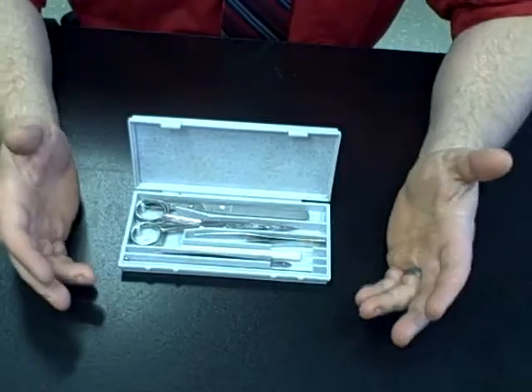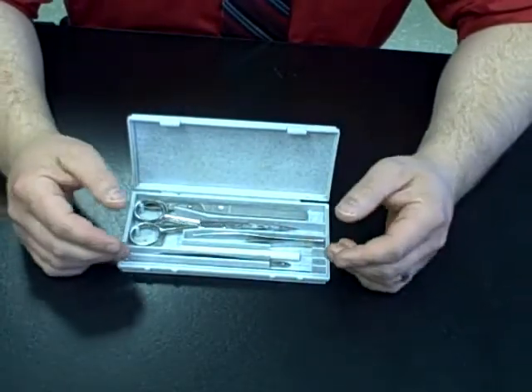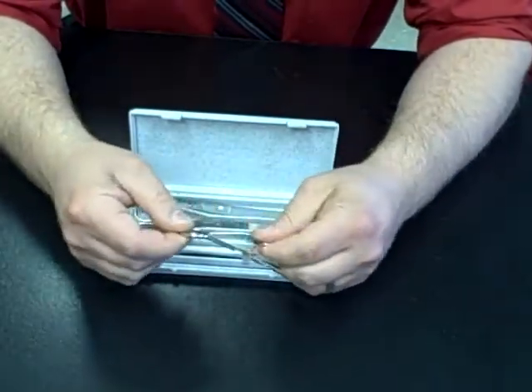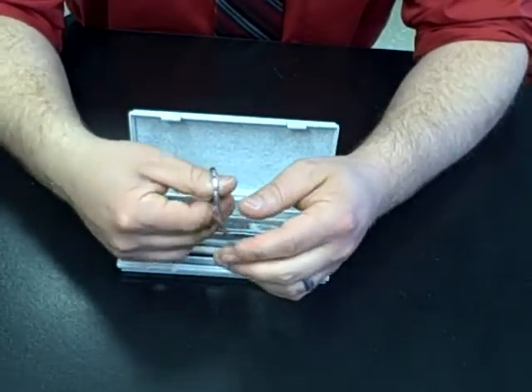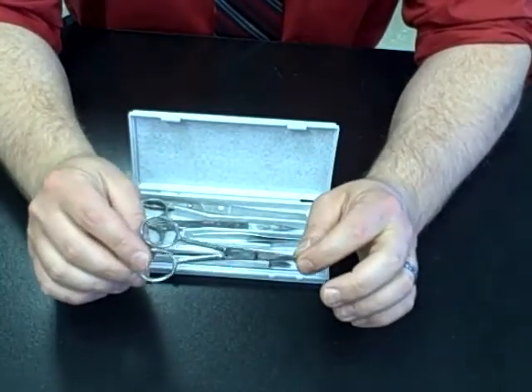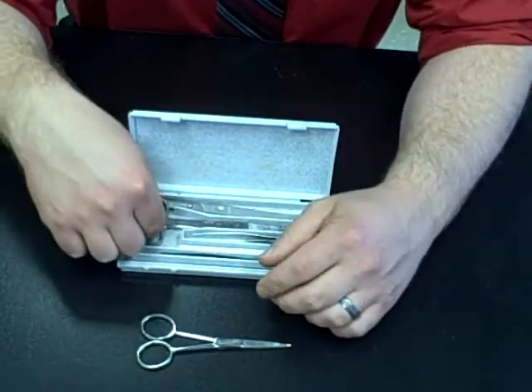Welcome to the first video in our series on dissections. The first thing I wanted to do is just go over the tools that you'll have in your dissection kit. To start with the simplest and probably most useful tool, you have your pair of fine scissors. These have more of a point, so they're good for fine precision cutting. You'll actually find that these are much more helpful than your scalpel for most of the cutting tasks in our dissections in class.